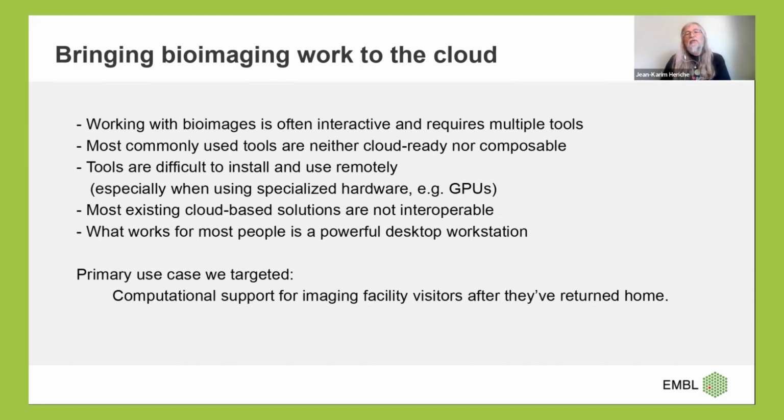data. So the facility wants eventually to support them, but they can't keep people around in the facility at the local workstation for 6 months or a year or whatever time it takes to actually process and analyze the data. So in essence, we have the image data stored somewhere, accessible from the facility, but it should also be accessible, and the compute should also be accessible to the visitors once they're back in their home institution.